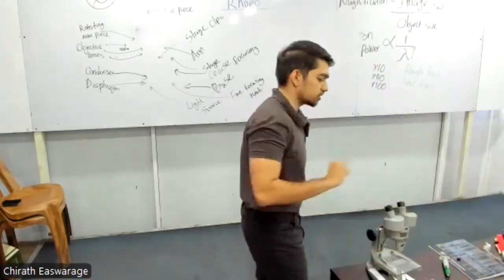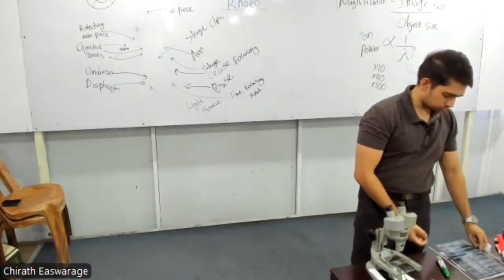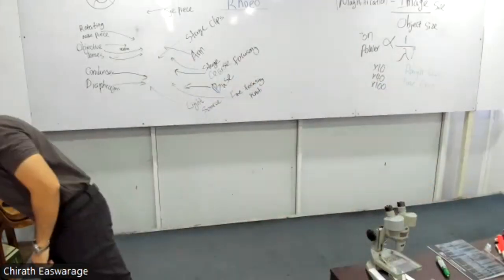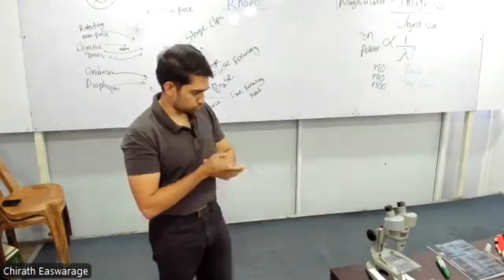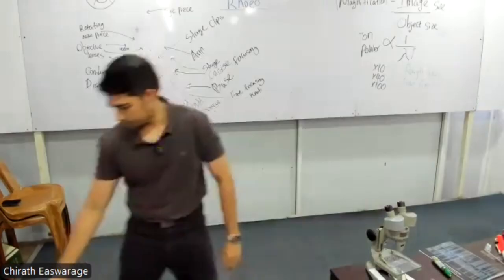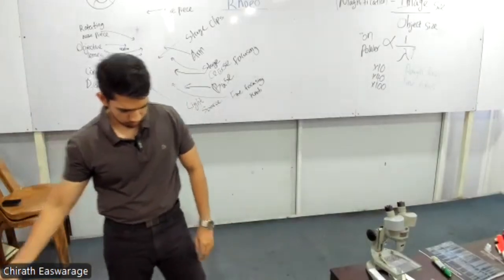The next practical is observation of specimens taken from the electron microscope. I have some electron microscope images that I'll show you using the projector. Okay, come back to the resource book. Next topic, online people also come back to the resource book.